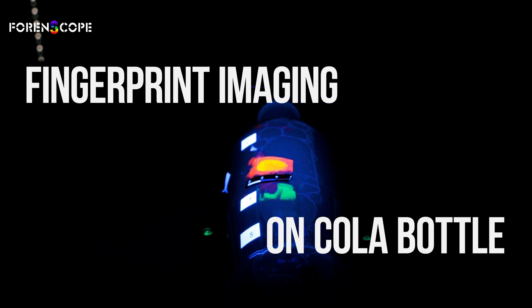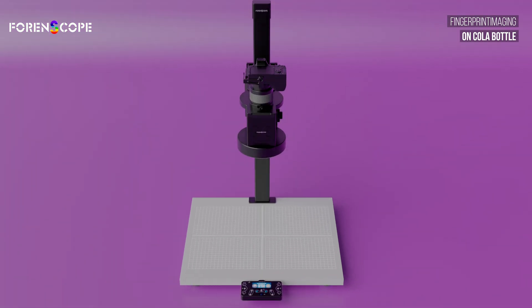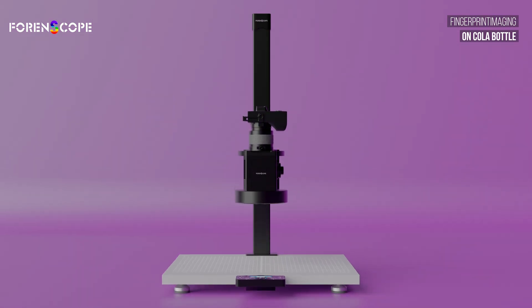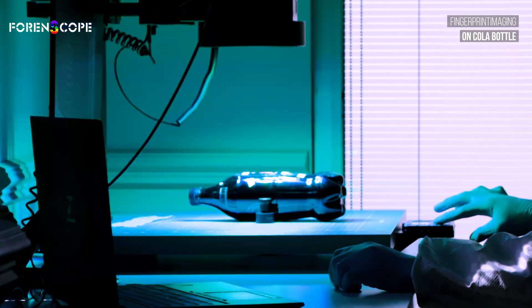Capturing fingerprints on a curved, reflective plastic cola bottle is a complex task. Unveiling the invisible with Contactless Lab Ultra. Our advanced device uses a precise mix of lights and filters to highlight powdered fingerprints effortlessly.